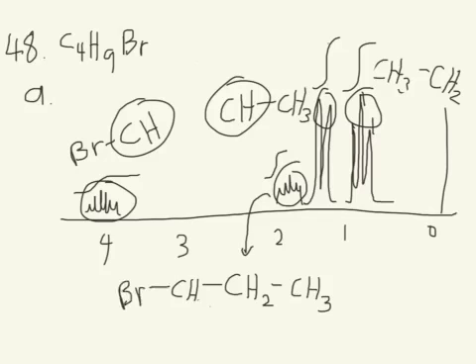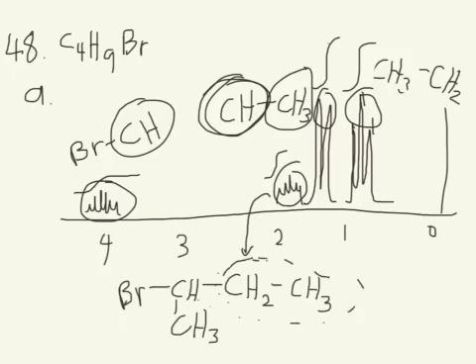So we can put that down. And if that's also this CH, well, we know that's also bonded to the CH3 right here. So we can add that. And that is our molecule. And we can recognize that this portion of the molecule here corresponds to the CH3CH2 we found at the beginning.